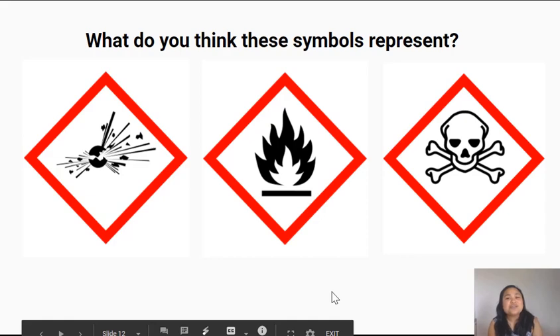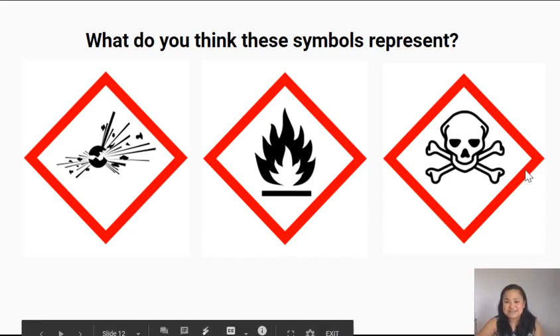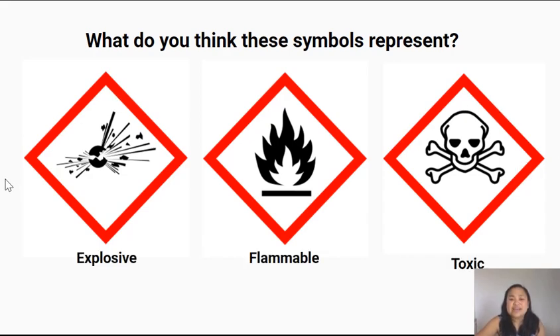I want you to think about what these warning symbols may represent. We've got three here. Turn to the person next to you and take a quick guess at what each of these symbols could represent. This first symbol looks like a ball that's been cracked with things coming out of it — it represents that something is explosive or has the potential to explode.